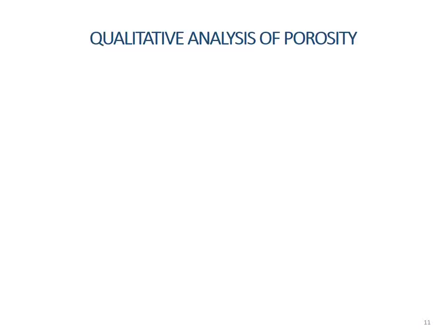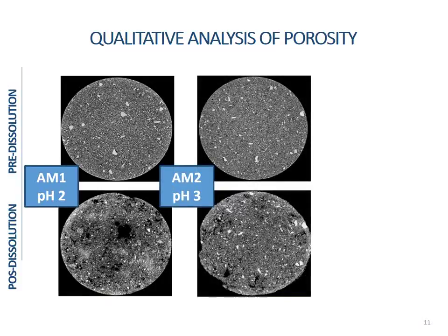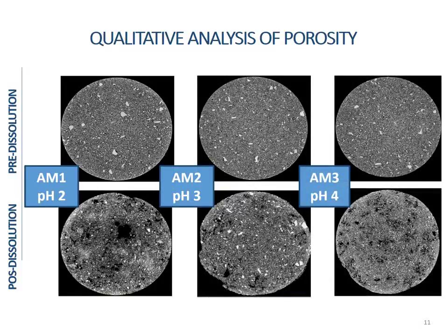Tomography was performed before and after the passage of the reactive fluid. It was possible to observe, in all cases, an increase of the porous volume. However, this analysis was only used as an observation and comparison tool, attributing a knowledge to the events arising from the dissolution process.